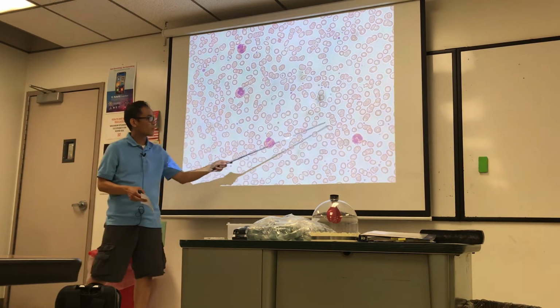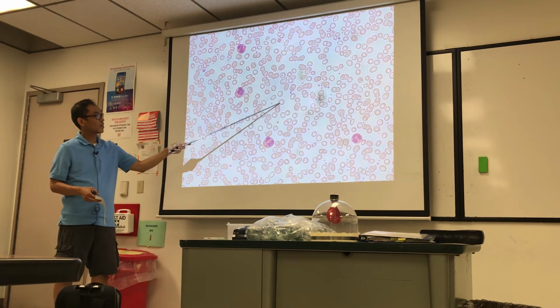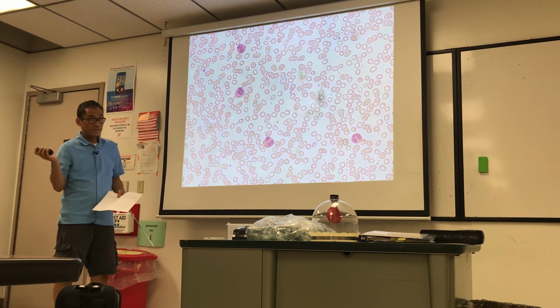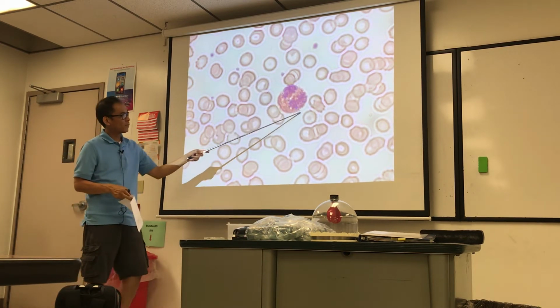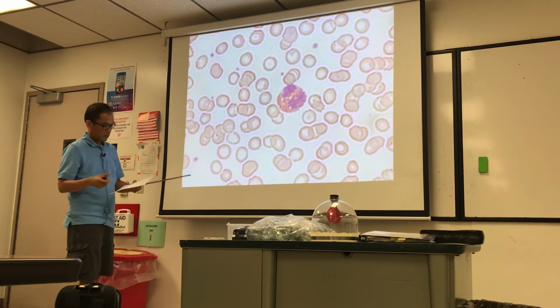Eosinophils. What are the fragments again? Platelets and all the red blood cells that surround it. That's the eosinophilia slide, an elevated level of eosinophils. Sickle cell anemia is the next slide, but this is, it's kind of blurry, but it's a close-up view of the eosinophil with the red granules and the bilobed nucleus. Okay.